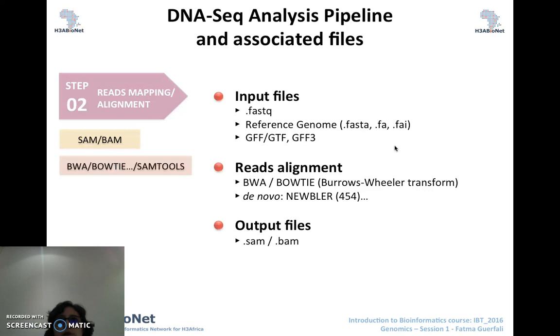So your output file formats would be a .sam and a .bam that are generated by these algorithms.